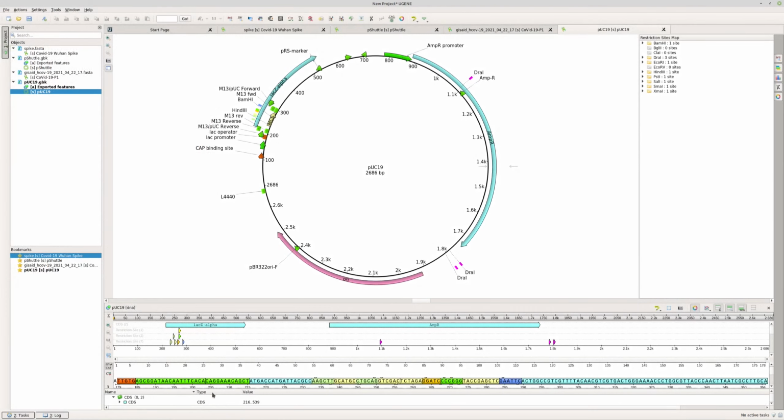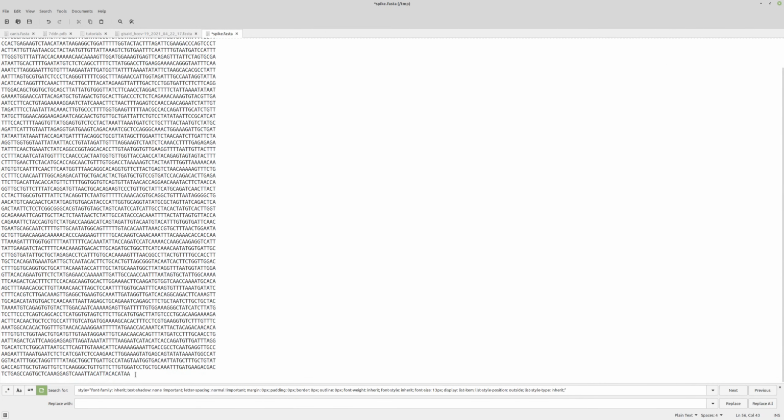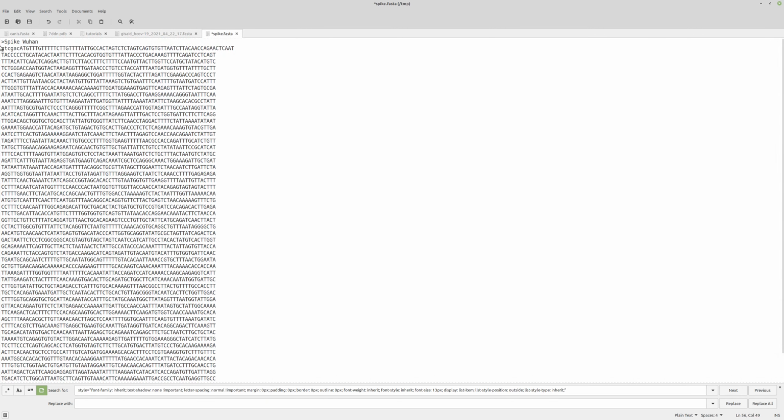And then the other one that we're going to look at is the SmaI, because that seemed to be working. So that's CCCGGG. Right? So now we would presume that we were able to create some primers that would amplify it and add these on to the end. Typically, in real life, you would actually add a few nucleotides before and after. There's actually a chart that you would utilize to determine how these enzymes like to land and cut. So, we're just going to put some ends here.